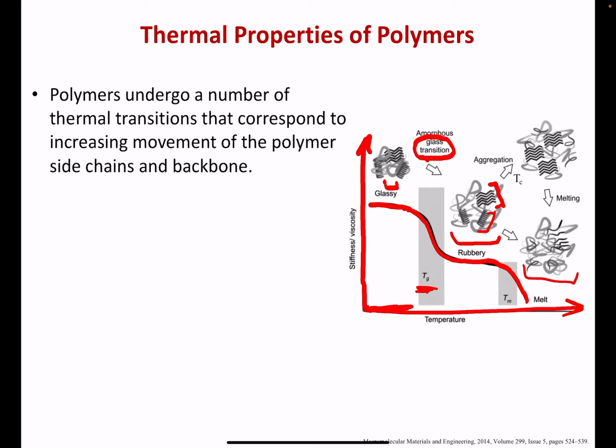In another scenario, it is possible that the material we started with had not crystallized as much as possible. So once the rubbery plateau was achieved, these chains, which are now moving above the glass transition temperature, can access conformations that can allow for addition to existing crystallites or nucleate new ones, and further crystallization can occur. And we see this reflected in our diagram where more chevron type structures have evolved. Sometime thereafter, melting can occur, and that still happens at the exact same melt point.